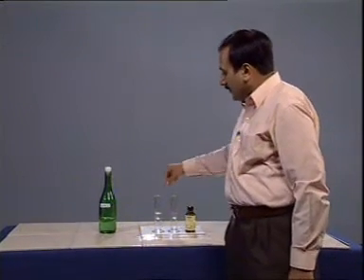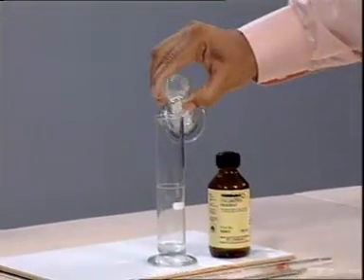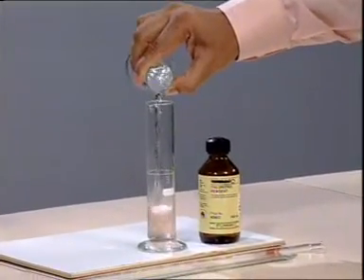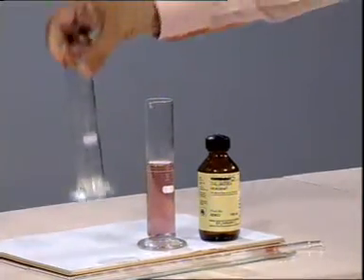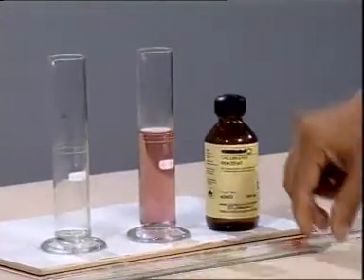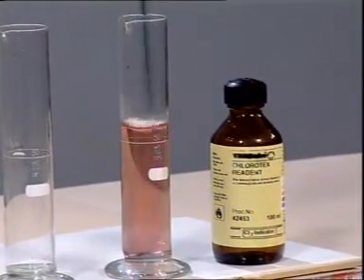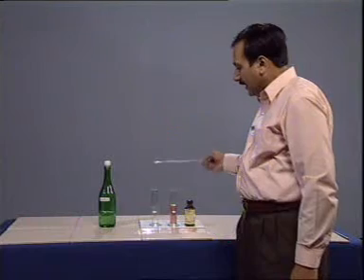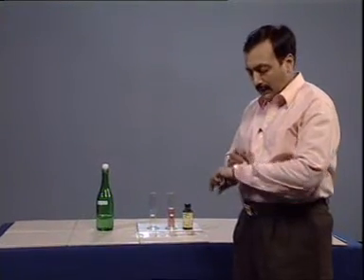Now transfer the sample into the cylinder containing reagent. Stir it for a while and leave for a period of 1 minute.